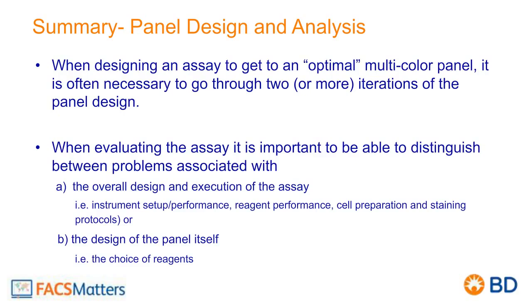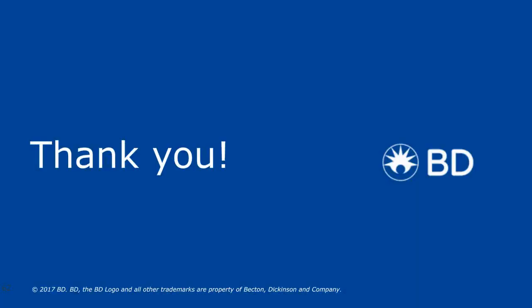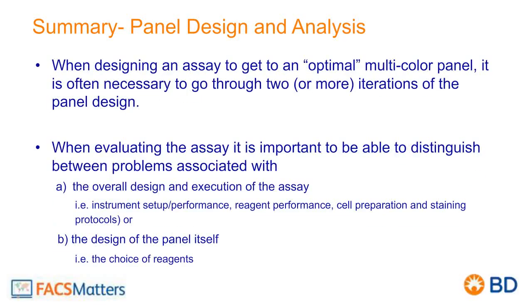When you're evaluating the assay, it's going to be important to distinguish between problems that are associated with the overall assay design and the execution, i.e., the setup, performance, reagent performance, and the design of the panel itself, in other words, the reagents you chose. That's what you want to try and do to minimize the number of iterations. So with this information, I believe you will be better prepared to develop your own assays and do it effectively, economically, and in terms of time.